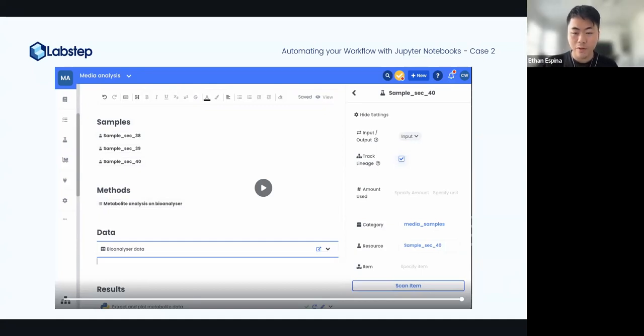We're coming through with a few more questions here. We'll just give them an answer and then we'll move on. But we have, how is the Python environment defined? Can we install our own custom packages and functions? Yes, well, it's defined in the same way that you would do it in your local environment. So if you want to use pandas, you would just start your scripts with import pandas.